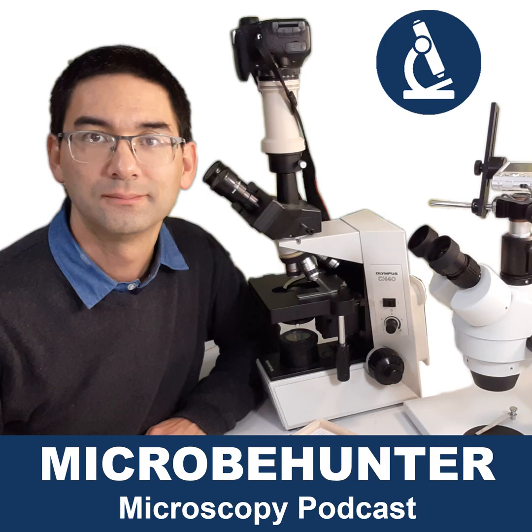And if you continue to magnify it, for example, by zooming in more, by using a camera or by using a stronger eyepiece, of course, it's going to become larger, but it's also going to become more blurry, and the features are still not visible.